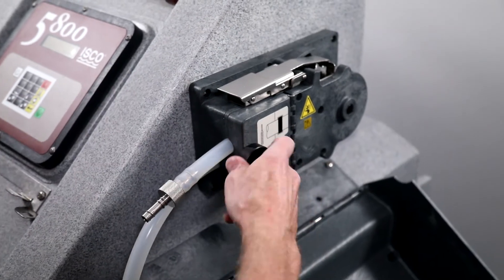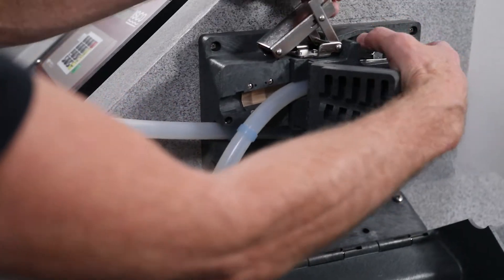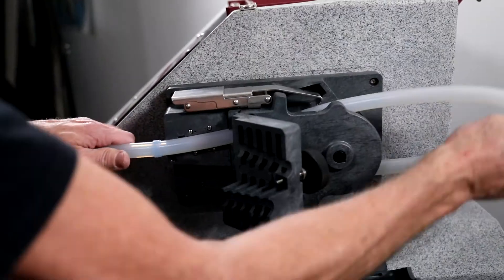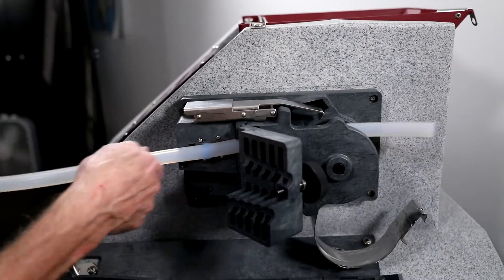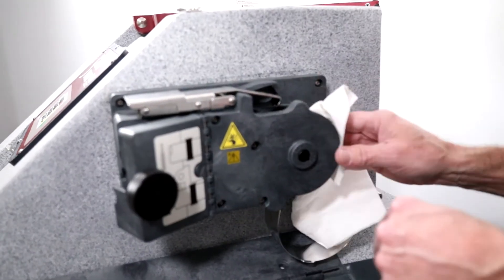Loosen the thumb screw that secures the liquid detector cover, pull the pump tubing off of the bulkhead fitting, and open the top latch that secures the pump band. Remove the pump tubing. Clean out any silicone buildup off of the pump rollers or pump band.